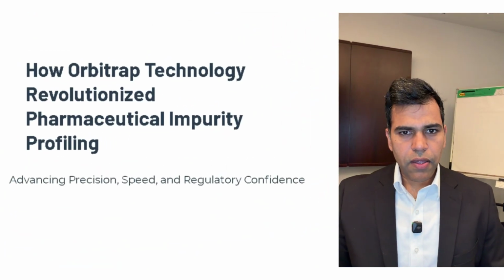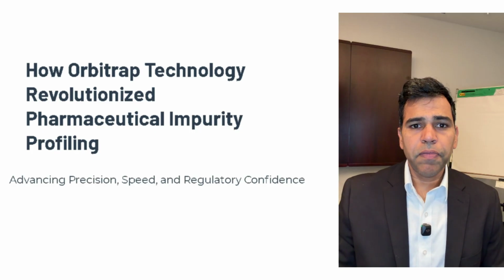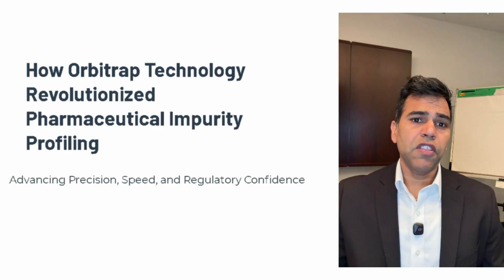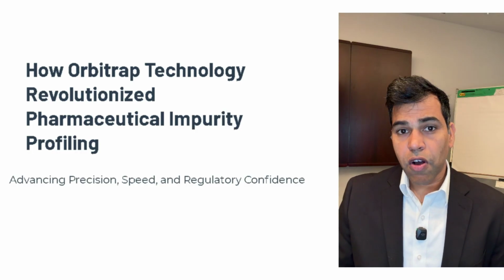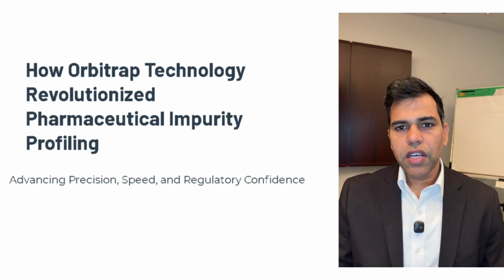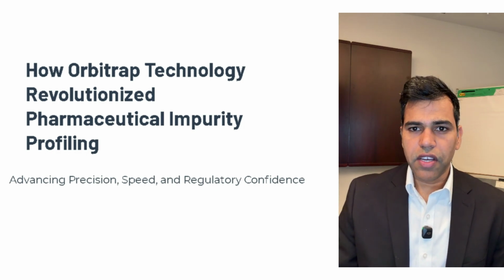What if a drug that passed every standard quality test still harmed a patient? Not because the API was wrong, not because of a formulation error, but because of a trace-level impurity, something very tiny and small, your instrument literally couldn't see it. That's not a hypothetical, that's the real kind of risk that keeps analytical scientists up at night.